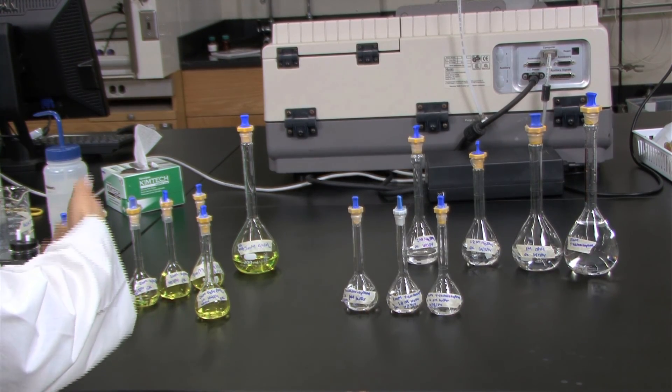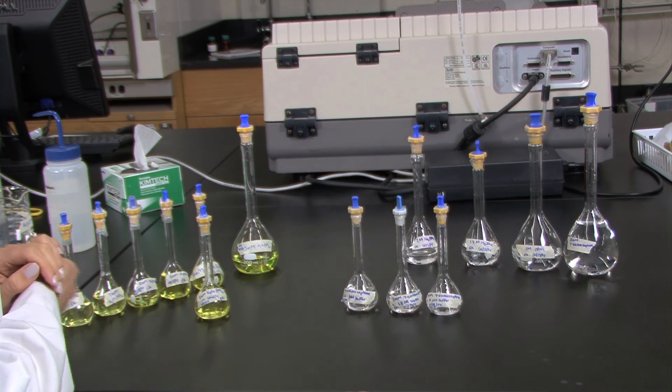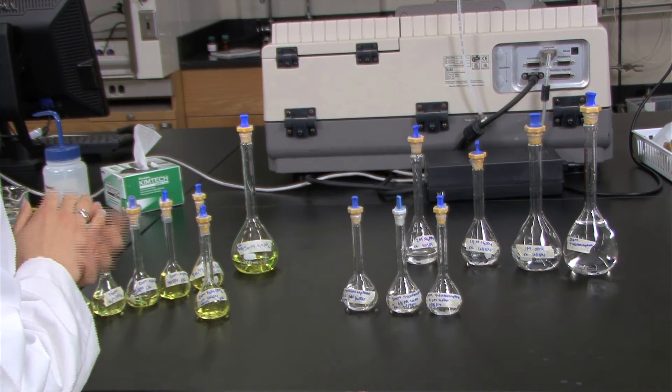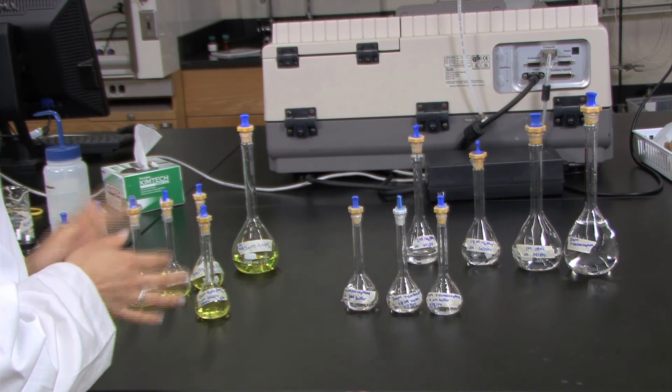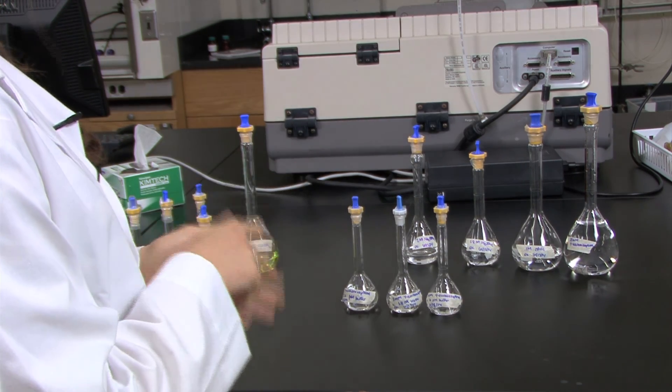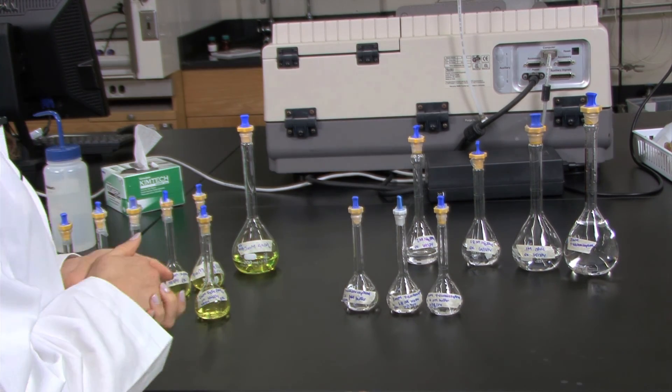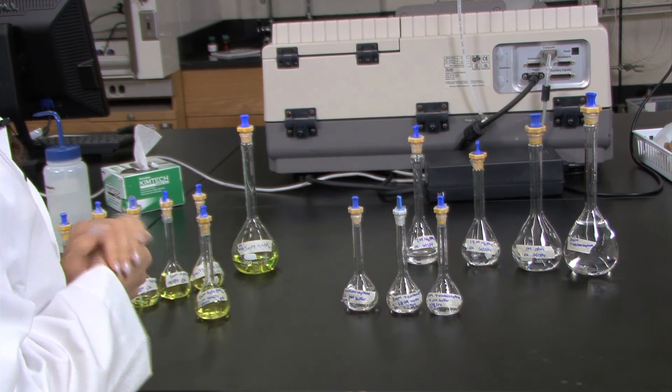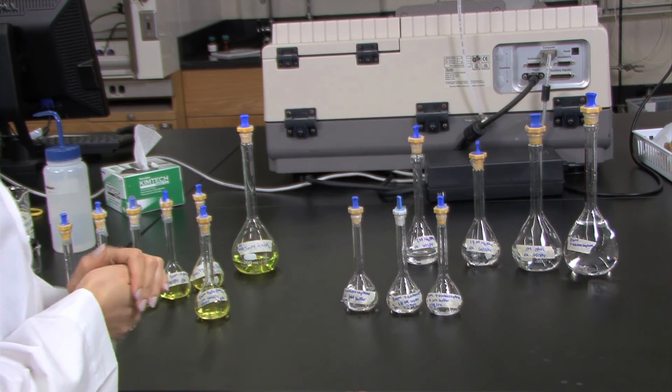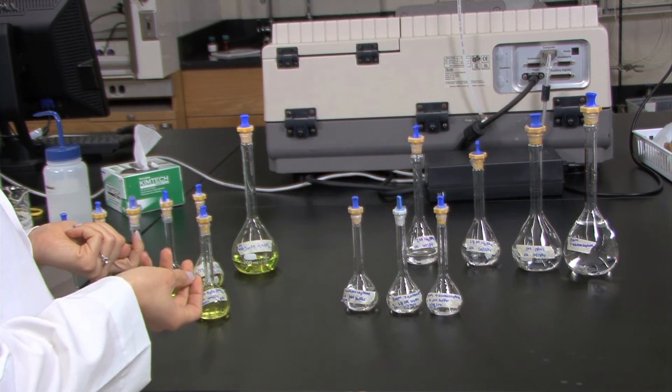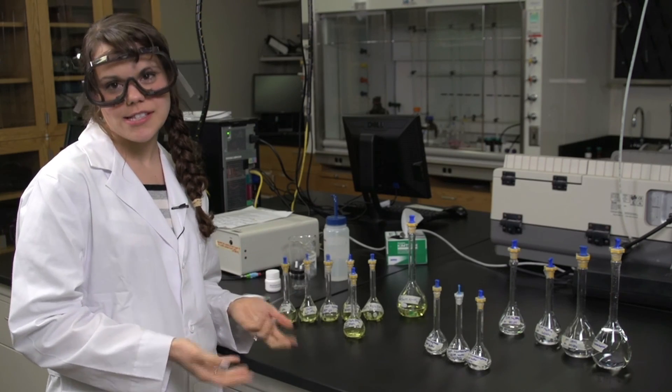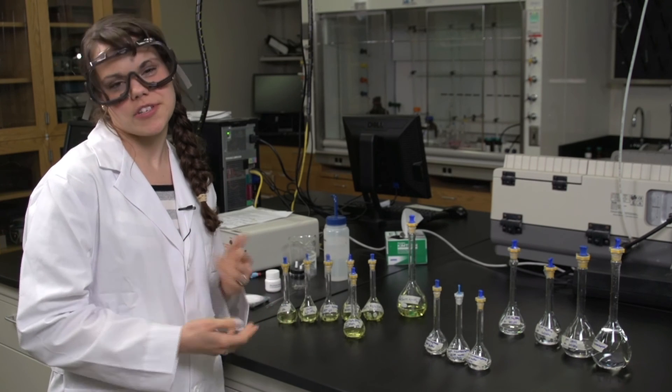On day one, you'll be preparing a series of dilutions of potassium ferricyanide and potassium nitrate, as well as a solution of potassium ferricyanide and sodium sulfate. On day two, there are two different buffers that need to be prepared along with a diluted acid, and you'll be using these as solvents to dilute 4-acetaminophenol. There are lots of solutions to prepare, so it's very important that you come to lab prepared with all your calculations, and teamwork will be essential to finish on time.